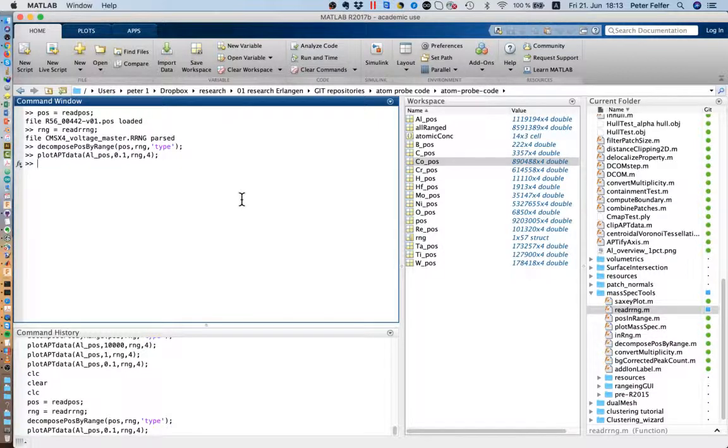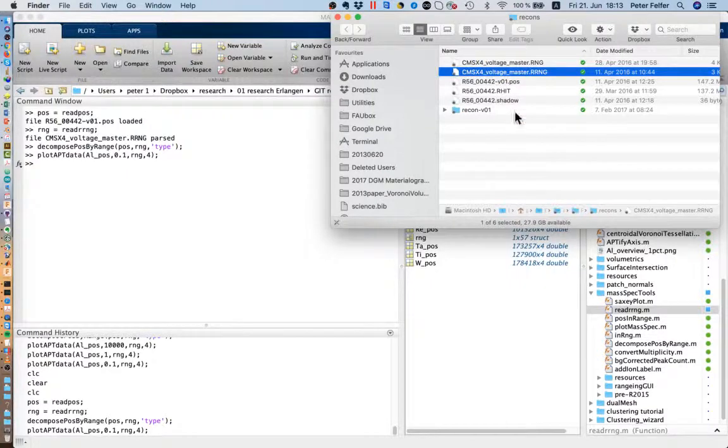And the good thing about it is you can use all of the analysis files. This would be a typical analysis folder from IVAS, and do very large batch processing. So I've partially made that so that I can have a piece of code that goes through all of different projects and pulls out things like, is there a correlation between background noise in the data and pressure of the experiment, stuff like that, batch processing. Okay, so that's about it if you're just fundamentally interested in how to do that.